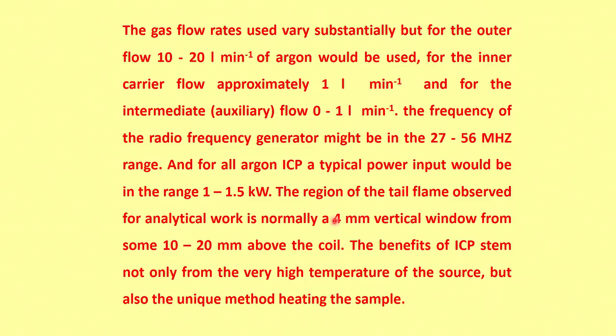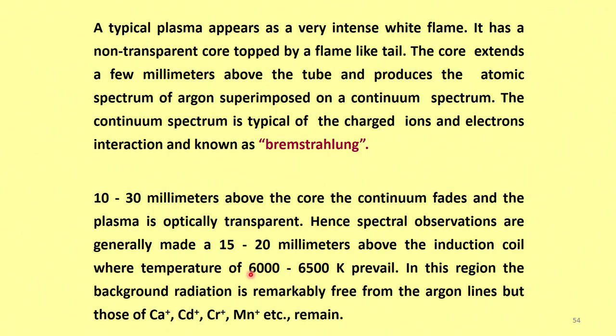So, the benefits of ICP stem not only from the very high temperature of the source, but also from the unique method of heating the sample, that is ICP for you. So, a typical plasma appears as a very intense white flame. It has a non-transparent core topped by a flame-like tail.